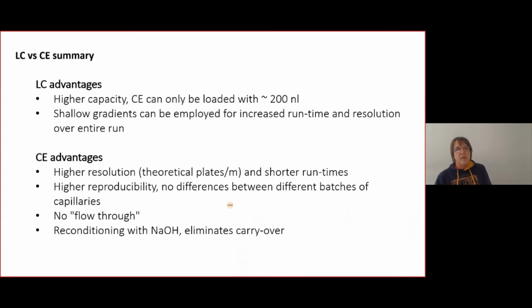Another issue is that we cannot run a shallow gradient on a CE. This can only be done on an LC. So if we want to go for increased runtime for better resolution in this respect, let's say run something for 6 hours, that's not possible. The CE run, the actual separation time is about 25 to 30 minutes.